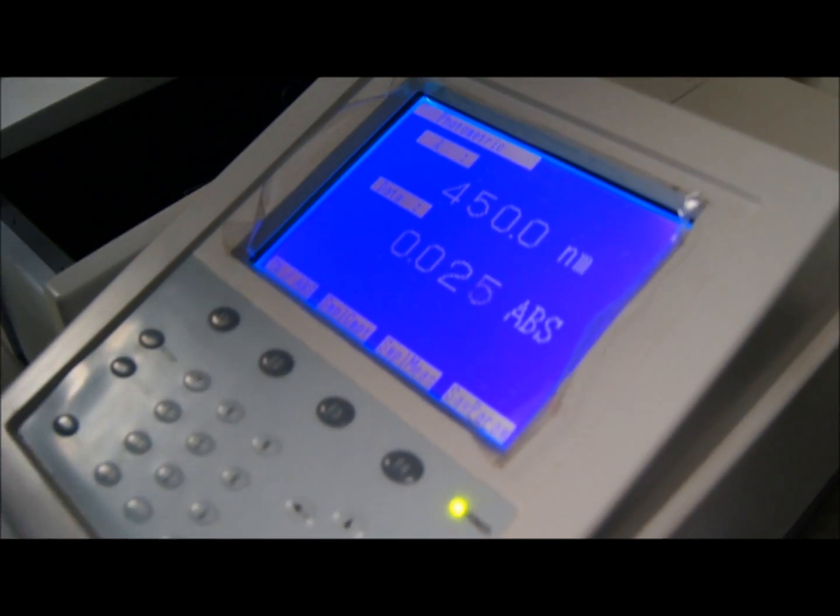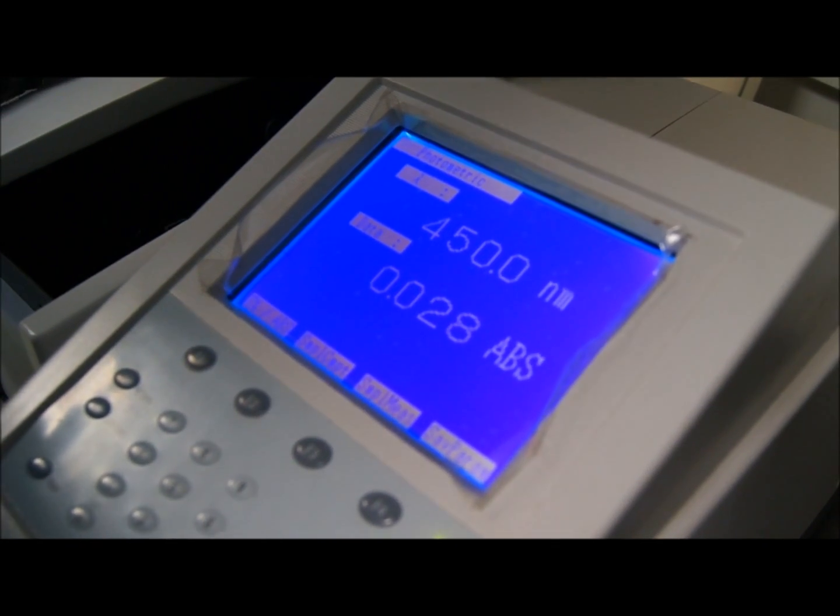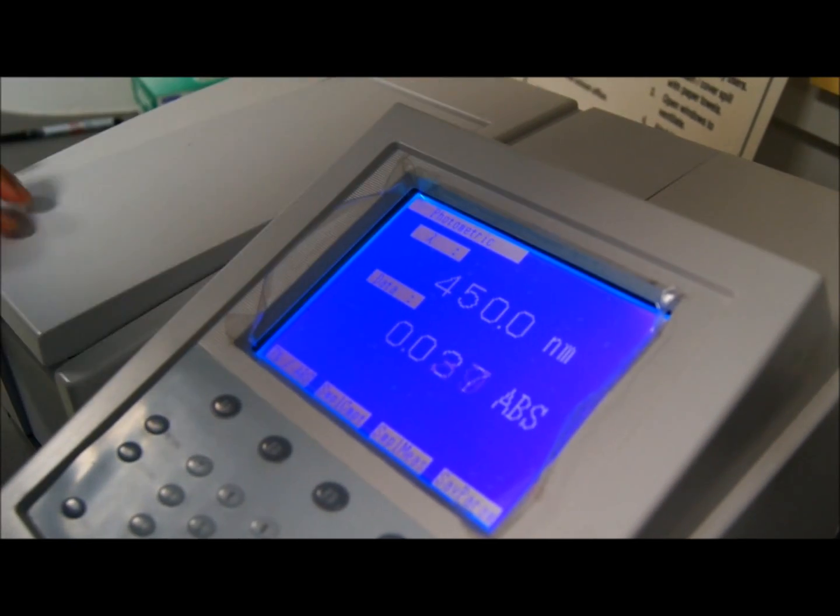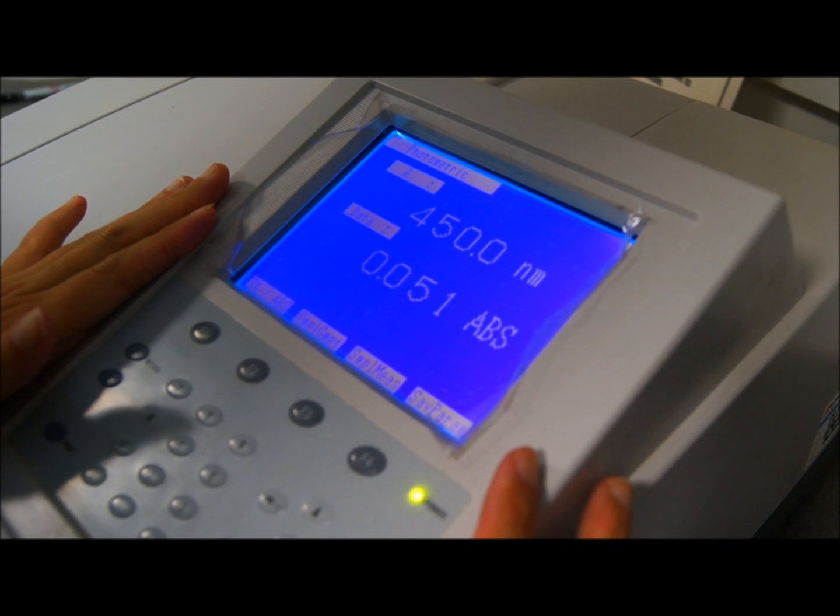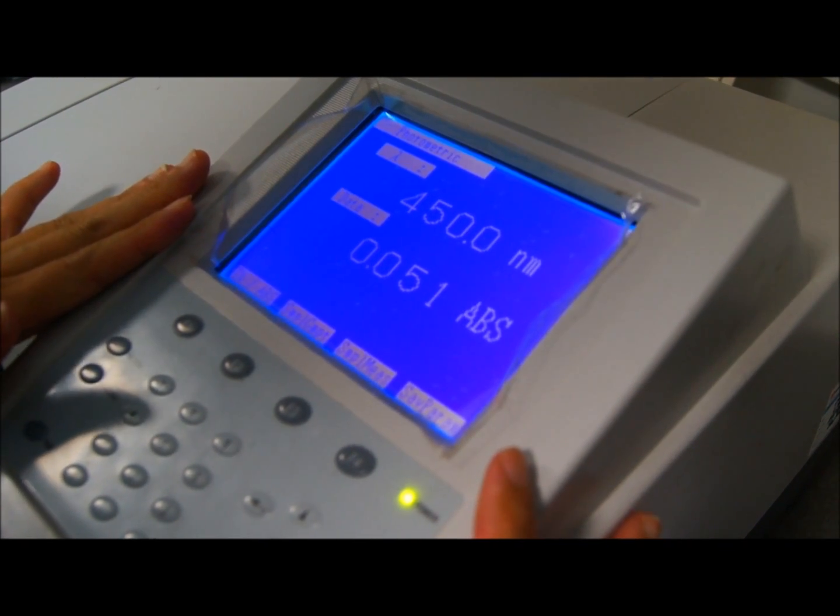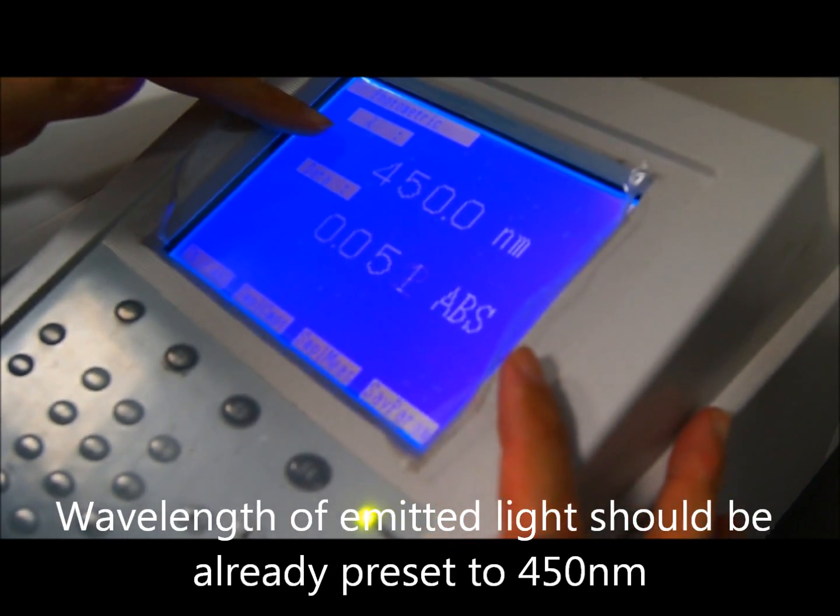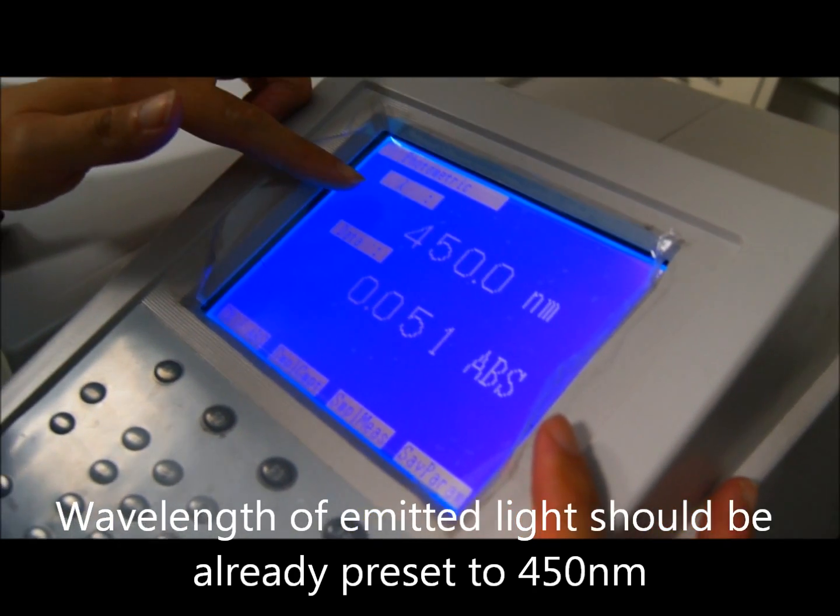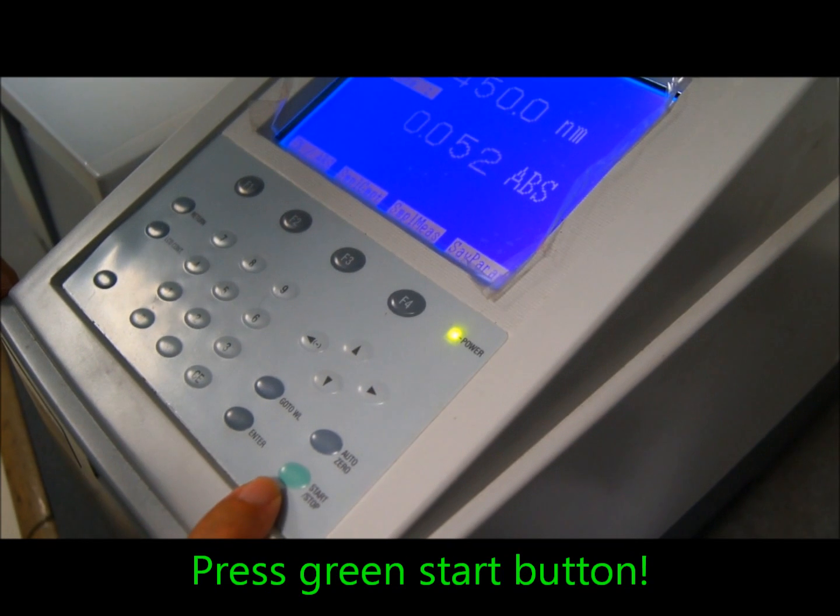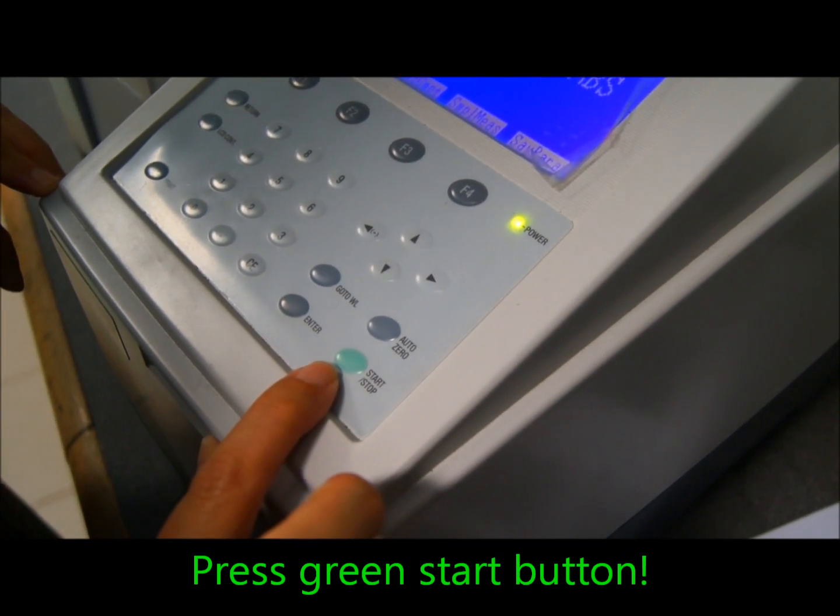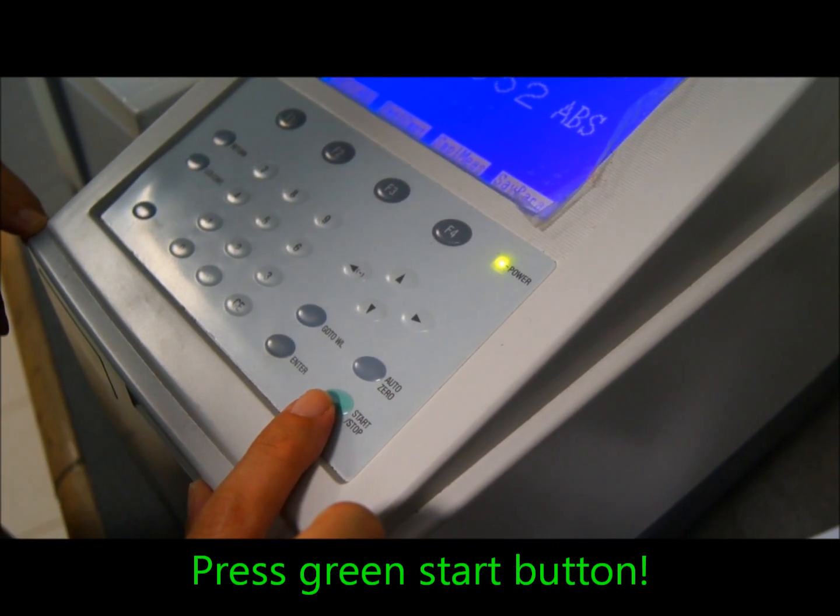Once you have placed the cuvettes inside the spectrophotometer, close the lid and make sure that the display is to the main measurement page, which should look something like that with the wavelength that you are using. And all you need to do is to press the start button, which is at the bottom right-hand corner, it's green. So we will press it now.